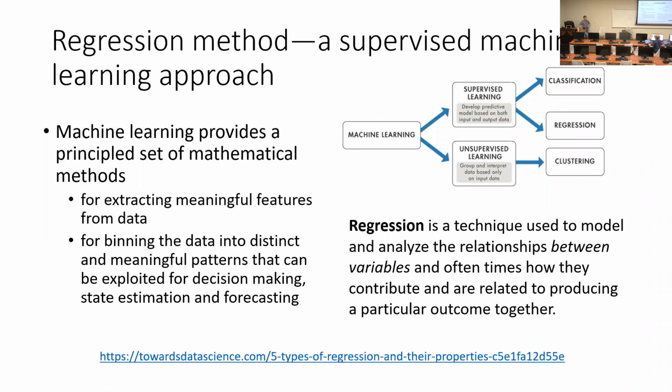If you do the linear regression, you have a linear model. You can have an interaction term. I will show you how to do it later. It's not a nonlinear model, it's a linear model.